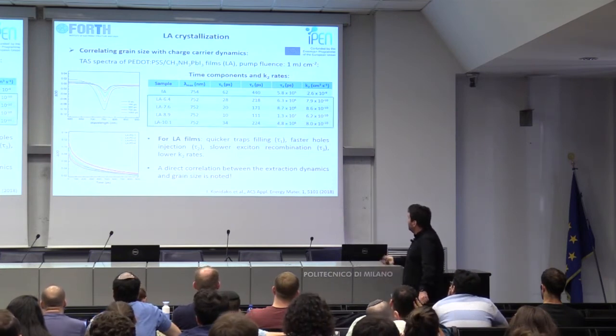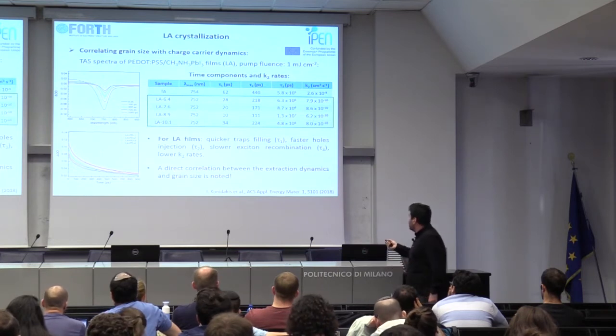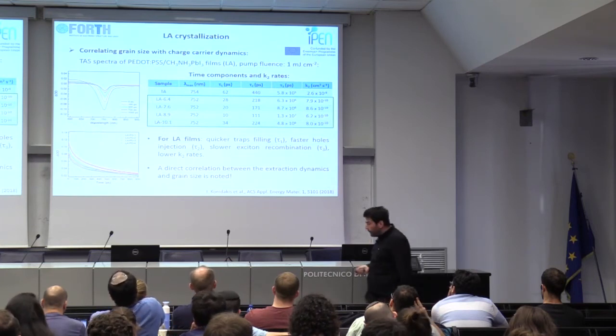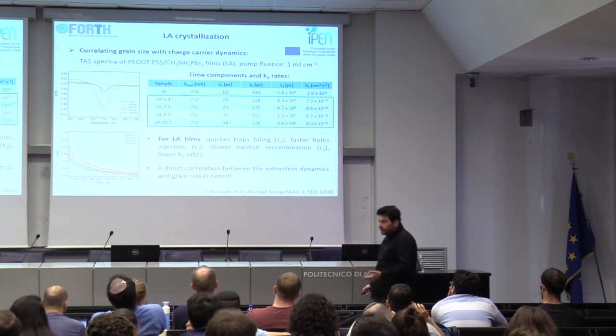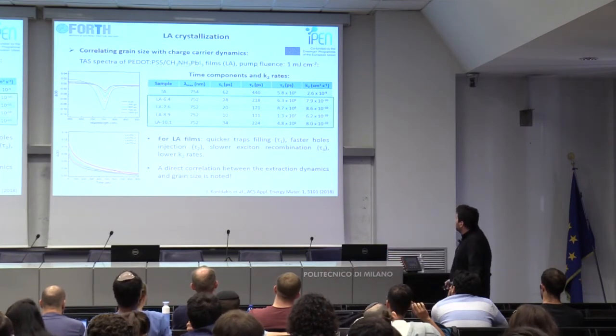And it becomes apparent that all laser samples exhibit faster T1 and T2 components, which means that they have faster trap fillings and faster charge extraction dynamics.